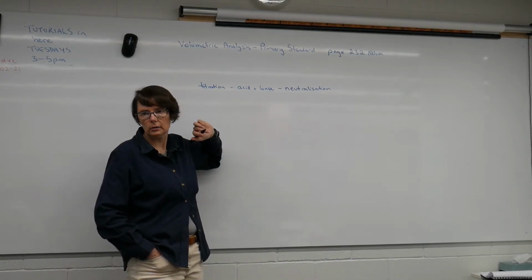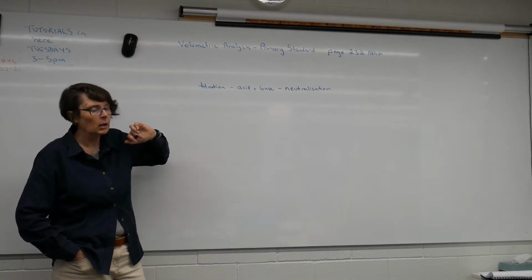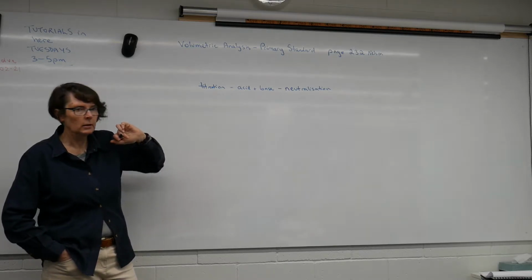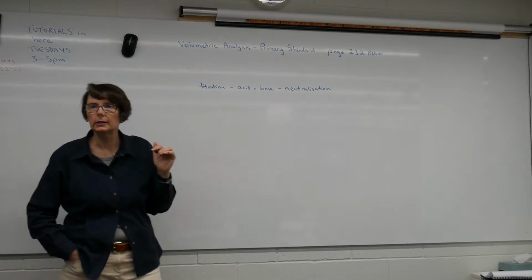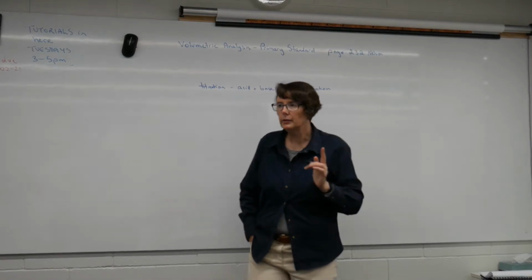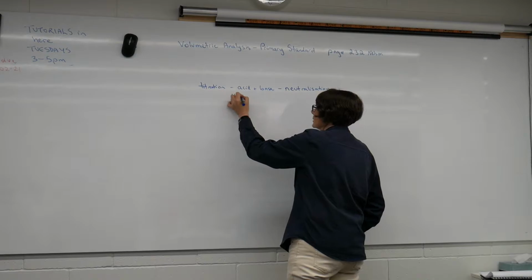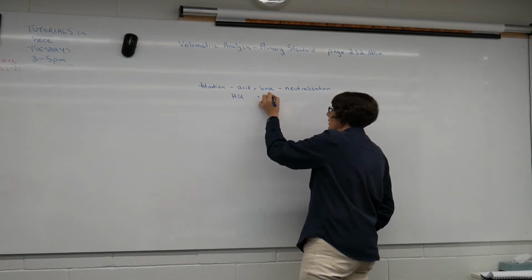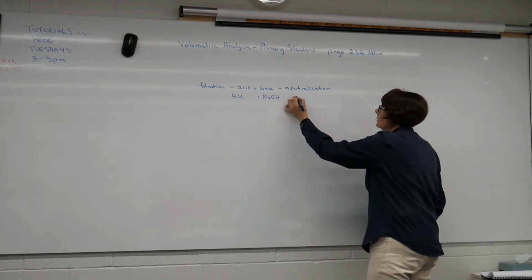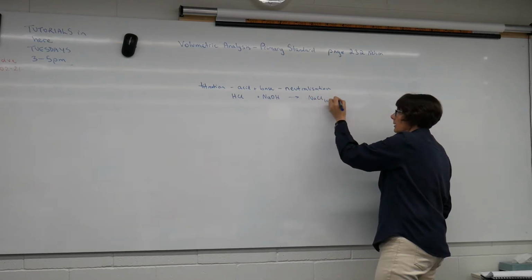Do you remember what colour phenolphthalein is? Pink in base, and colourless in an acid. That's right. So for our prac that we're going to be doing very soon, we're going to use hydrochloric acid and sodium hydroxide. That's going to be our reaction. We know then that produces a salt and water, so it's sodium chloride and water.